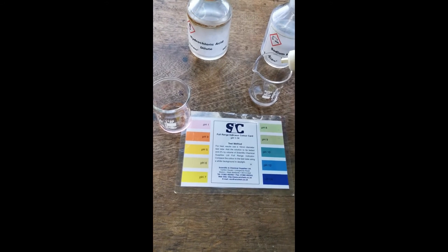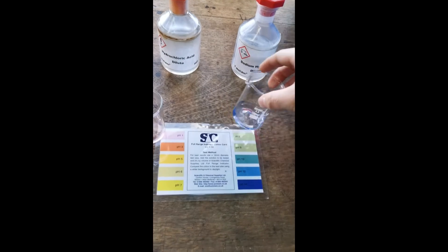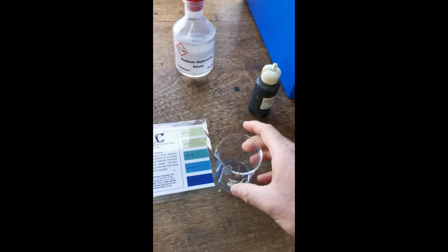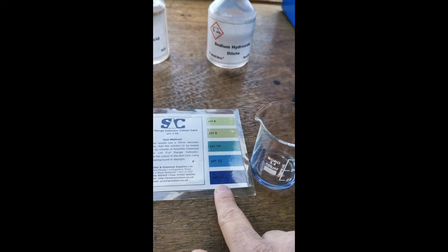Next I'm going to add it to the sodium hydroxide, and you can see that the colour turns very blue. We can tell that it has a pH of 14.